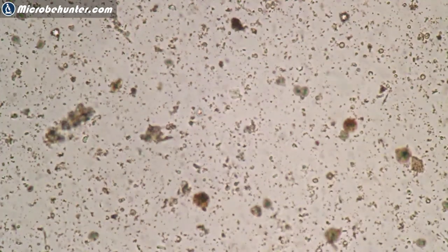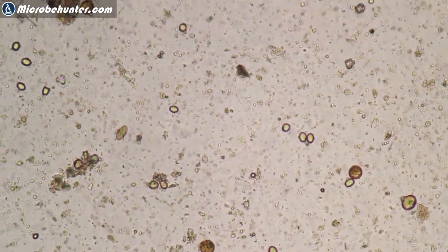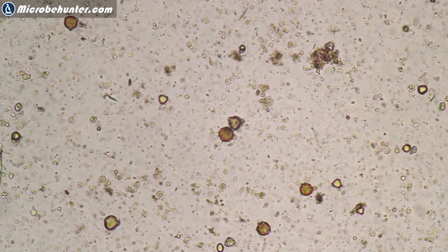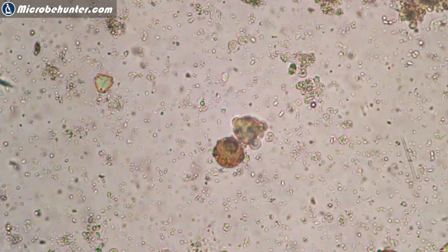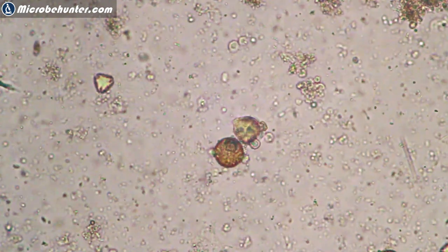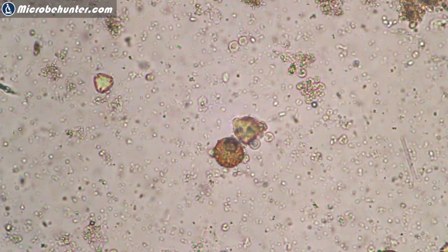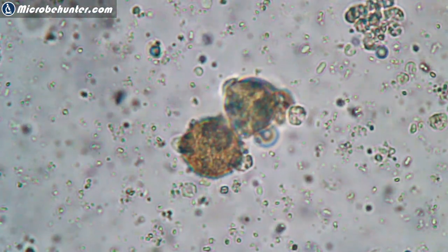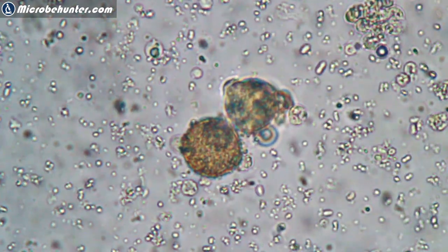And yeah, plenty of pollen and other things. Those large round structures — these are the pollen. But there was lots of other stuff as well that I found in here. So it was able to concentrate the pollen. I was quite happy about that — that's almost something I expected to happen anyway, but it is successful. And here there are a couple of pollen grains, those large round structures. The next step would be to identify the pollen and to find out from which plants they are — that's a whole new separate area that I'm not going to get involved in right now.